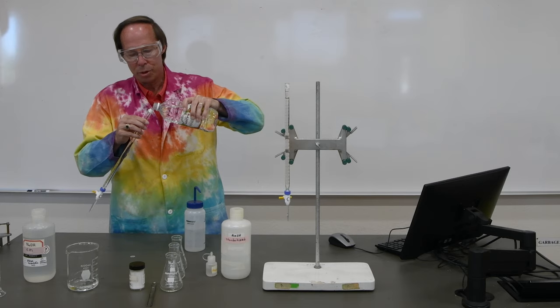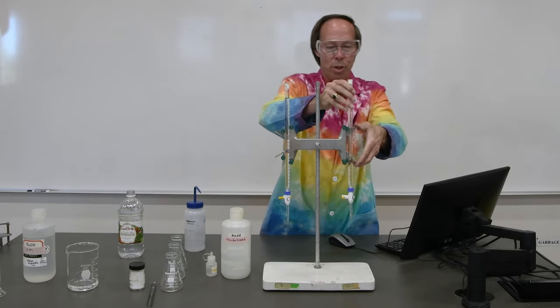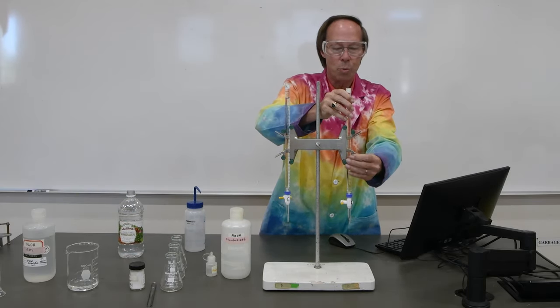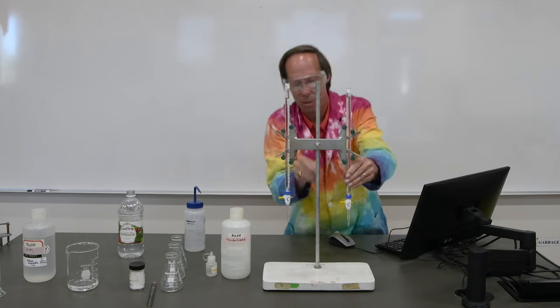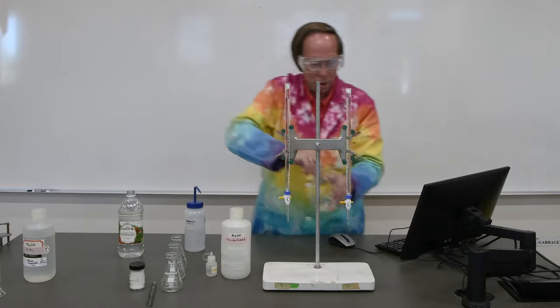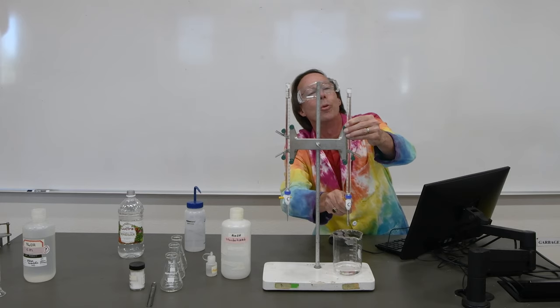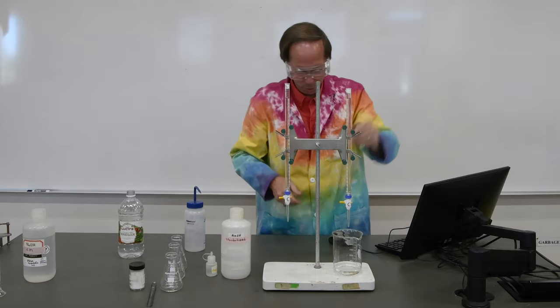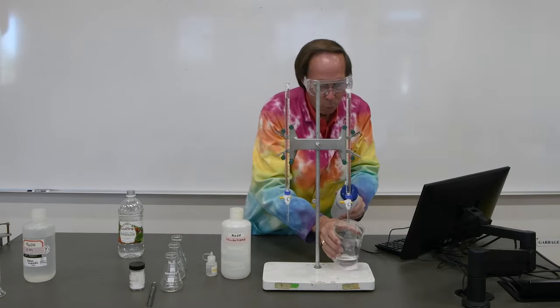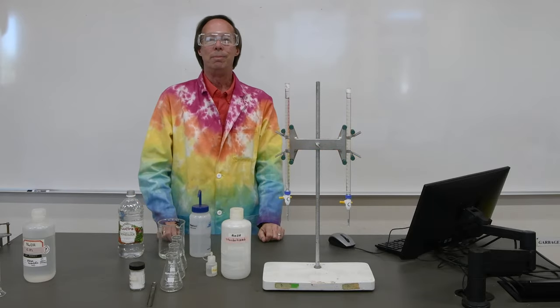So like we did with the sodium hydroxide, we'll fill this up. We got a little bit above the zero mark, so we'll have to drain a little bit of that, and then we can get our initial reading. So we'll take our waste beaker here, and we'll try to set this right on zero like we did the other one. So we'll drain that down just a little bit, and we're right on zero. We'll shoot off that one little drop of vinegar there, and now we're about ready to go.